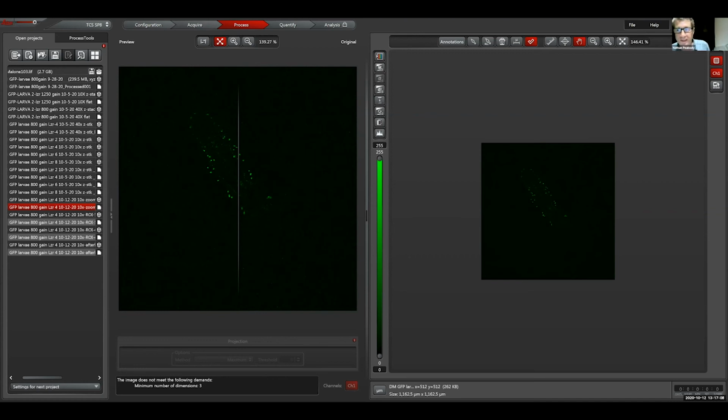Okay, I'm going to put them in your folder, which is going to be all the stuff we did today. There's a couple region of interest, and then an after bleach. And just add those into your folder.